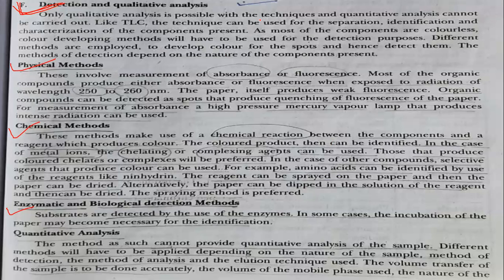Like TLC, the technique can be used for the separation, identification, and characterization of the components present. As most of the components are colorless, developing methods have to be used for detection. Different methods are employed to develop color for the spot and hence to detect them. The method of detection depends on the nature of components present in the sample.